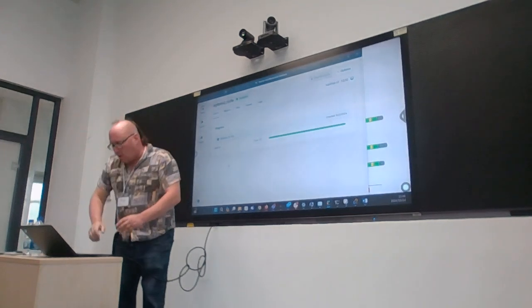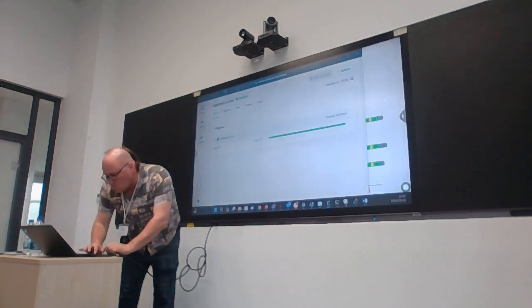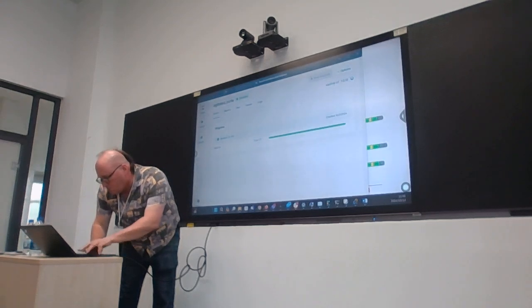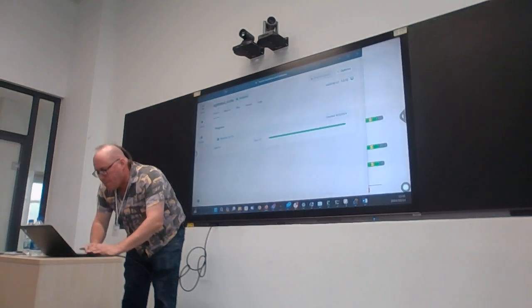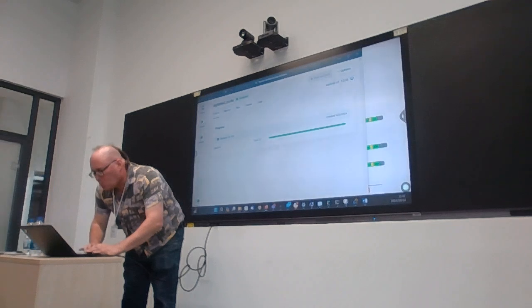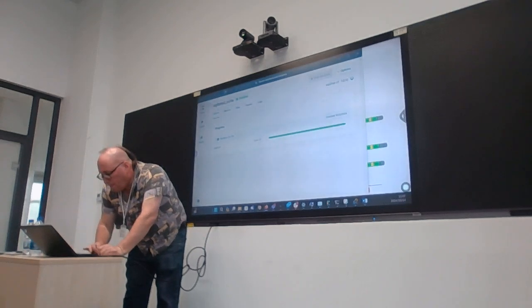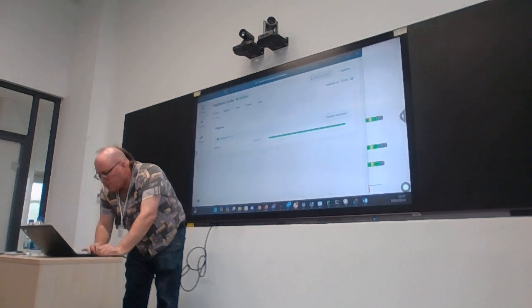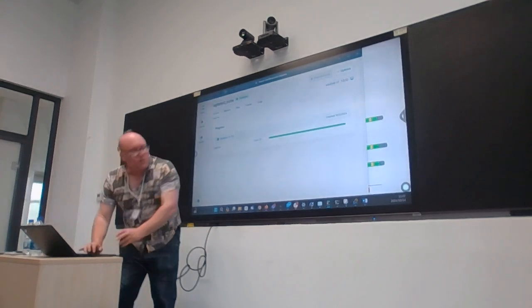Once you've run Squirrel, then let me show you the results. Sorry, let me find my mouse again. Let me just rerun Squirrel on my latest data.